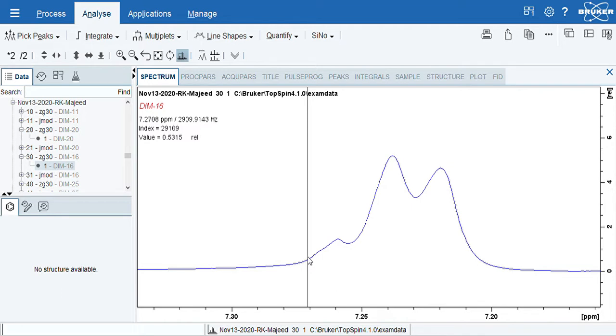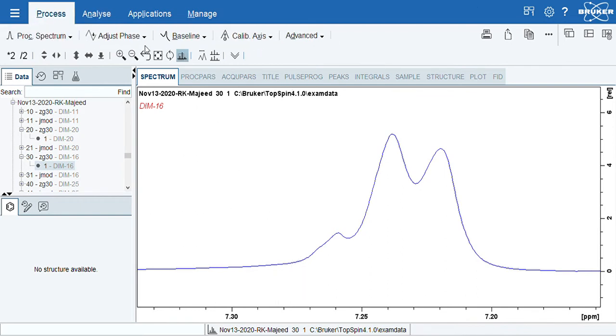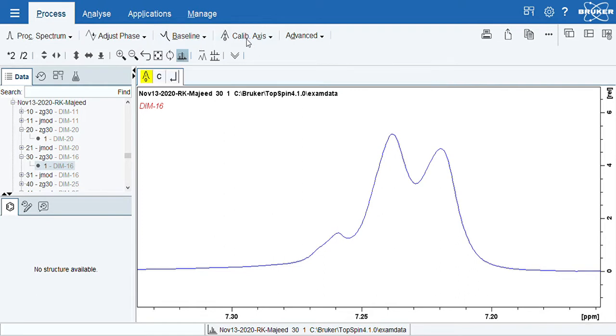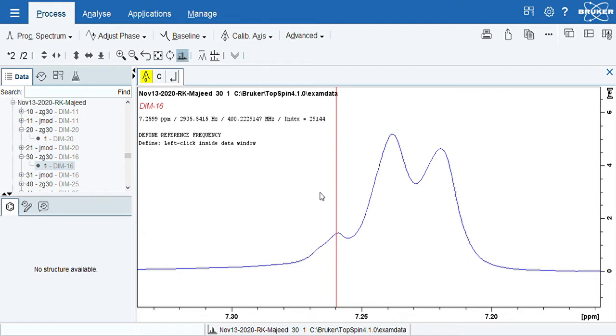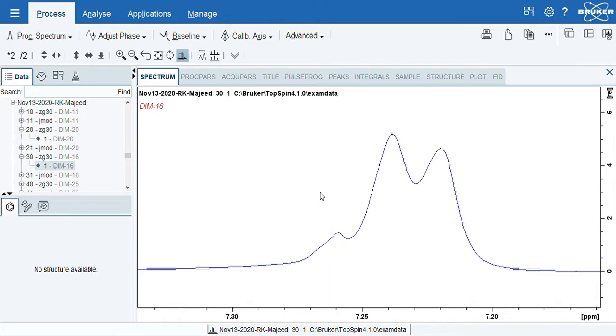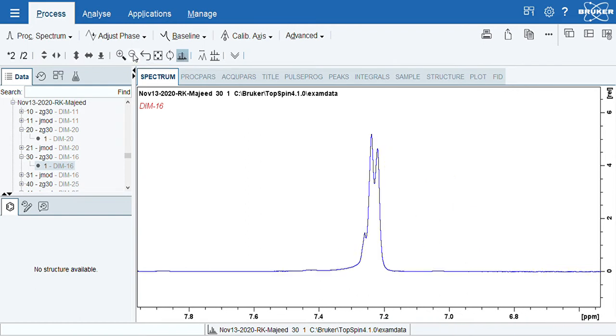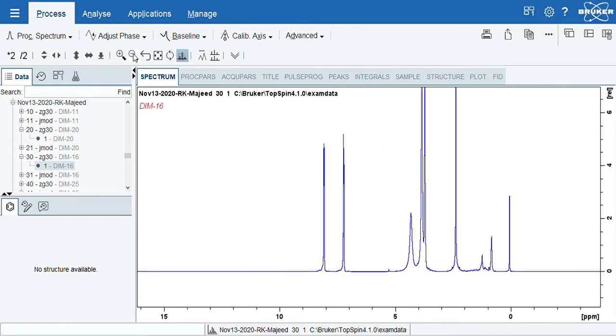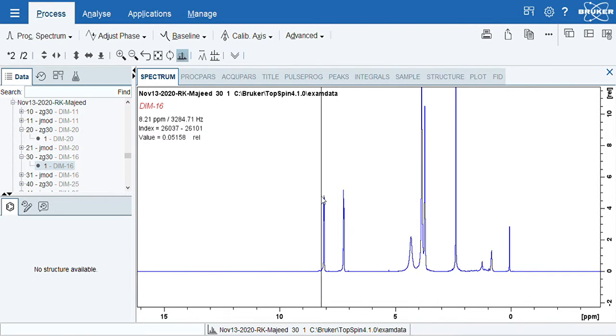I will calibrate the solvent peak by going to Process, then we have Calibrate Axis. I clicked on Calibrate Axis, then I just click on the 7.26 peak, then I need to adjust it to 7.26 and then say OK. Then basically my solvent peak is calibrated.